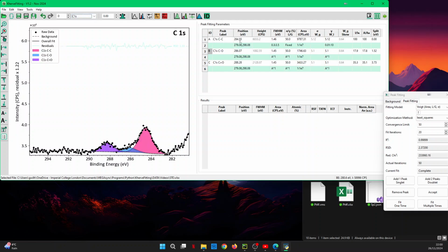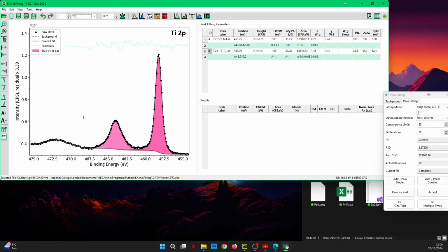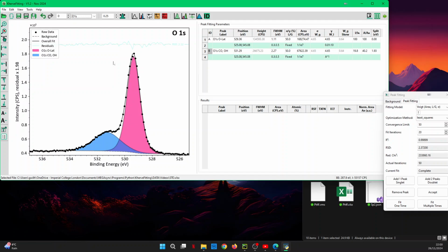you can see it's 284.55, so that should be 0.25 if I want to put that to 284.8, and I can be, as I said, anywhere, and you should see the value written here. And now everything has been shifted and the value is 0.25, so everything has been corrected. All those positions have been corrected to that, and as you can see it's 284.8. And now I am ready to export that to the result grid.